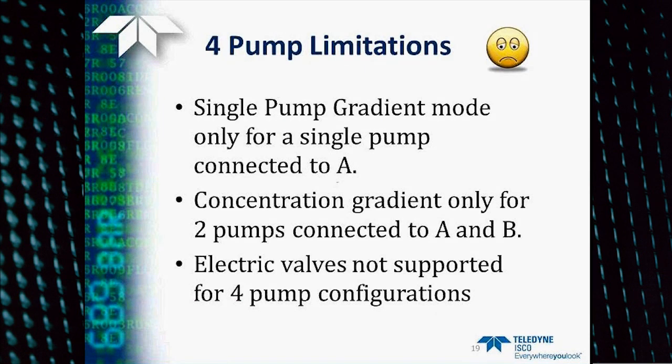Now there are a few limitations of what you can do with this software. One is if you're running single pump gradient mode, this is only available for a single pump connected to the A connector. Also, concentration gradients are only available for 2 pumps connected to A and B. Also, electric valves are not supported with 4-pump configuration.